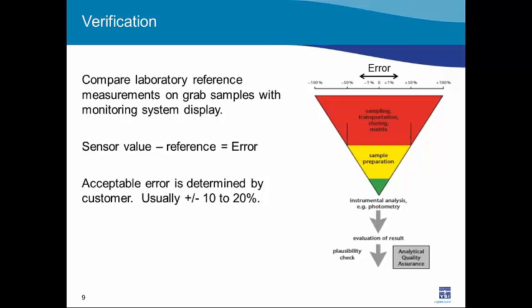The next step, sample preparation, which is really important, also has a substantial impact on the potential error in the sample. Once you get that sample properly collected and prepared, and you get it to the photometer, there is much lower potential for error, basically within the specs of the photometer. So really, looking at that triangle, the greatest potential for error starts at the sampling.